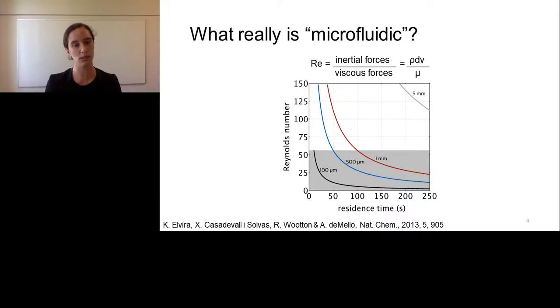So again, this is one example. We used other dimensionless numbers, but the Reynolds number, I guess, is the easiest one to understand. Okay, so it's the ratio of inertial to viscous forces on a microfluidic device, or those fluids on the microfluidic device, and it basically takes into account the density of the fluid that we're using. It takes into account the velocity of the fluid as it's pumped through the microfluidic device, and also the fluid's viscosity. But it also takes into account the characteristic dimension, or D, of your microfluidic device. And this is normally the smallest dimension on your device, okay?